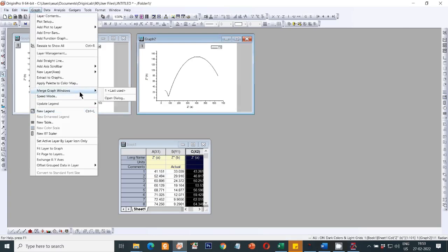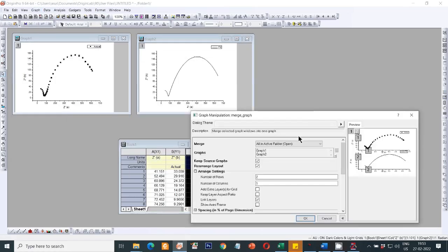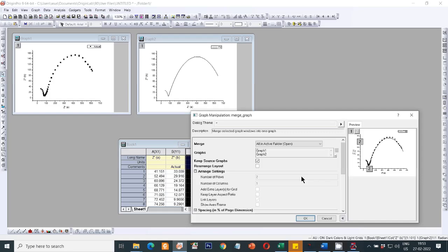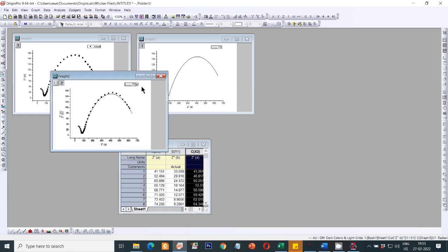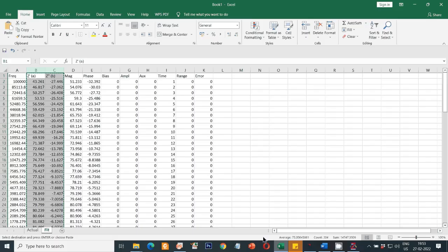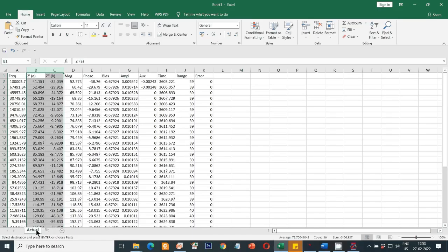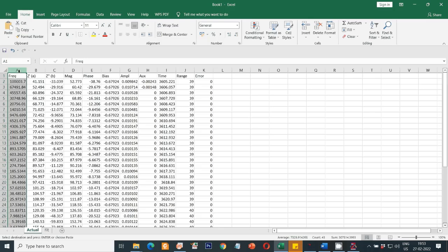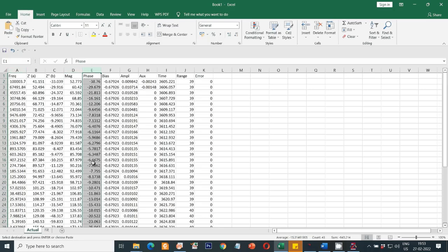Go to Graph, then Merge Graph Windows open dialog. Uncheck the Rearrange Layout option, then click OK. This will give you the final Nyquist plot. For the Bode plots, do something similar — from the actual files, select frequency as X axis and magnitude and phase as Y axes, and the Bode plots can also be plotted in Origin.